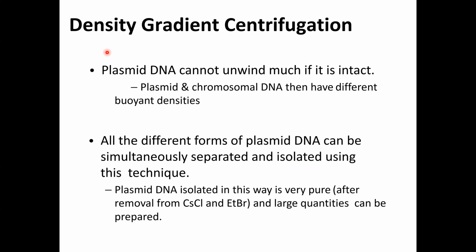You also have to take note that if your plasmid is intact, it cannot unwind. Your plasmid and your chromosomal DNA have different buoyant densities.